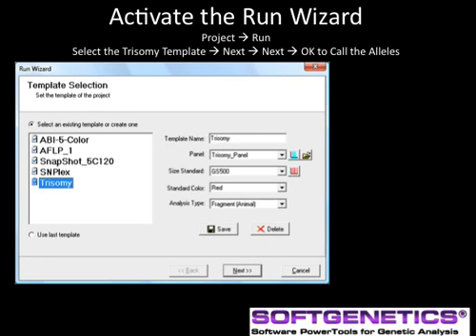As we saw in the introductory GeneMarker webinar, running a project is guided by the Run Wizard. Activate the Run Wizard at the project drop-down menu. Select the Trisomy template and enter the panel, size standard, and standard color that are appropriate for your chemistry from the drop-down menus.